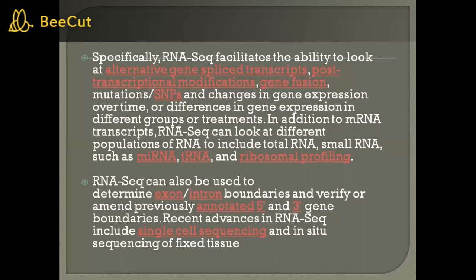Then RNA-seq can also be used to determine exon or intron boundaries and verify or amend previously annotated 5' and 3' gene boundaries. Recent advances in RNA-seq include single cell sequencing and in situ sequencing of fixed tissue.